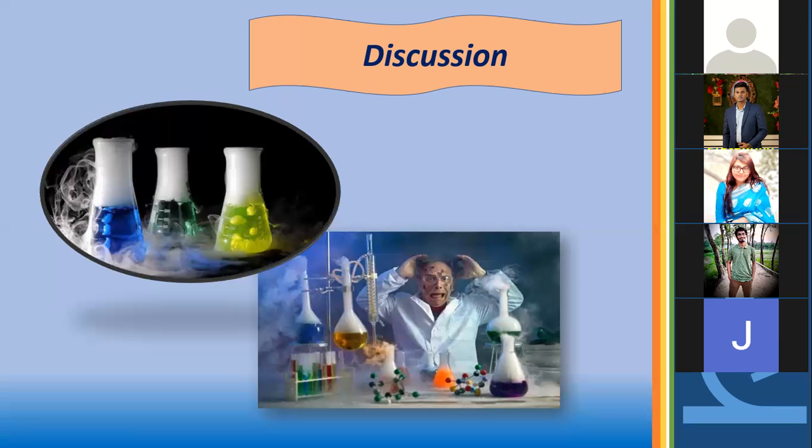And that's why we always need to keep the lower end of the pipette dipped in the liquid while sucking the liquid. If we want to avoid this kind of error, which can deviate the measured value from the actual value. At the end, when calculating the strength of the solution, we must calculate up to the 4th decimal place. So these are all the precautions we should remember during acid-base titration or reaction, because they can be dangerous.